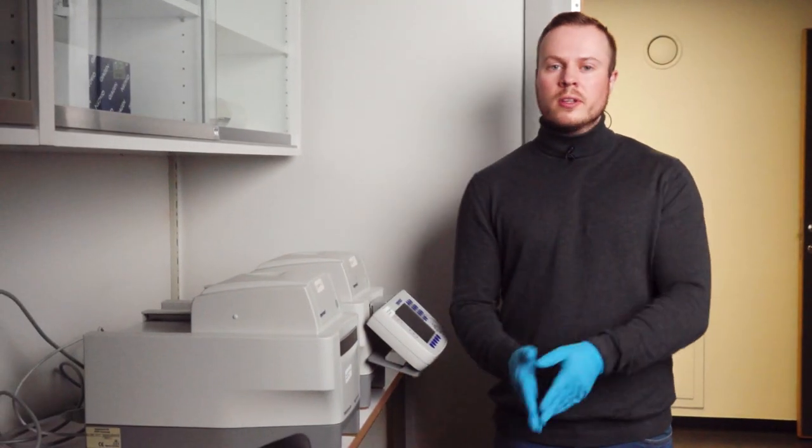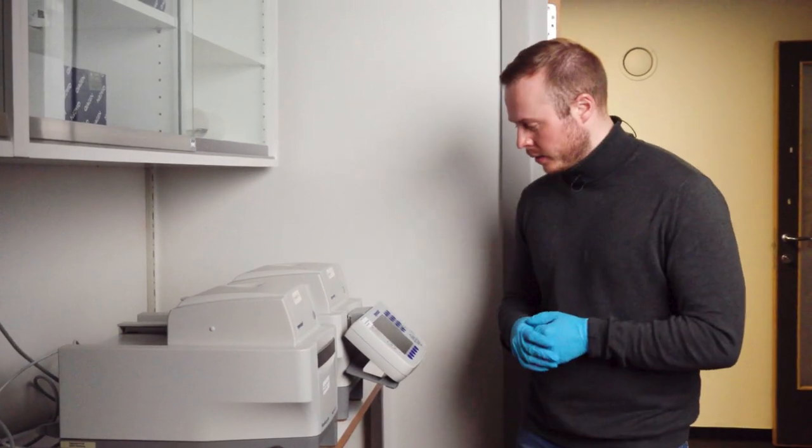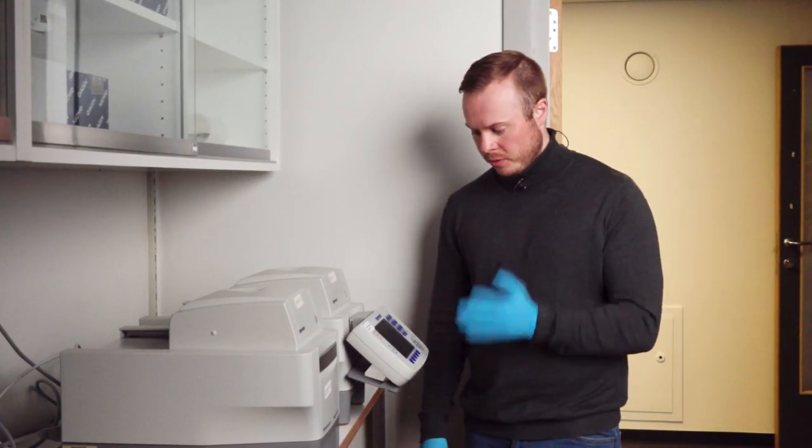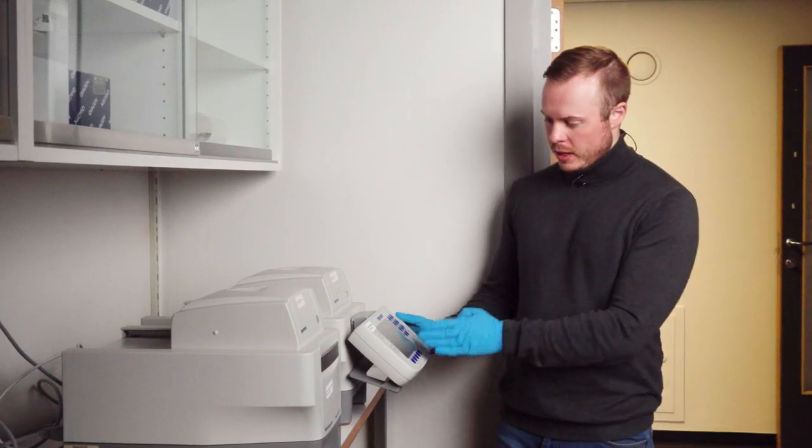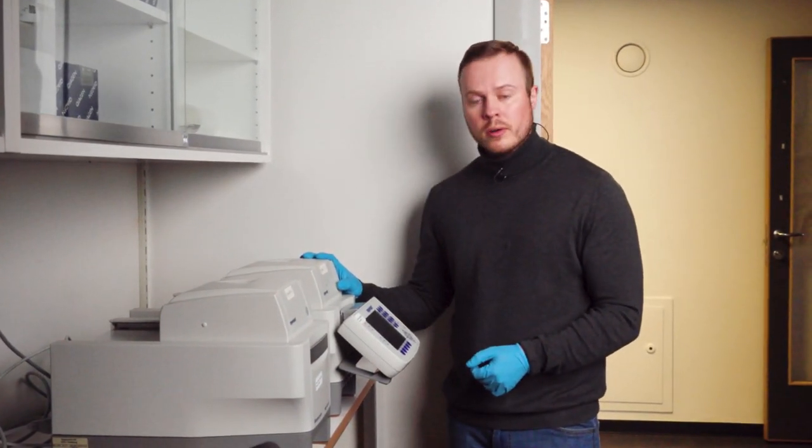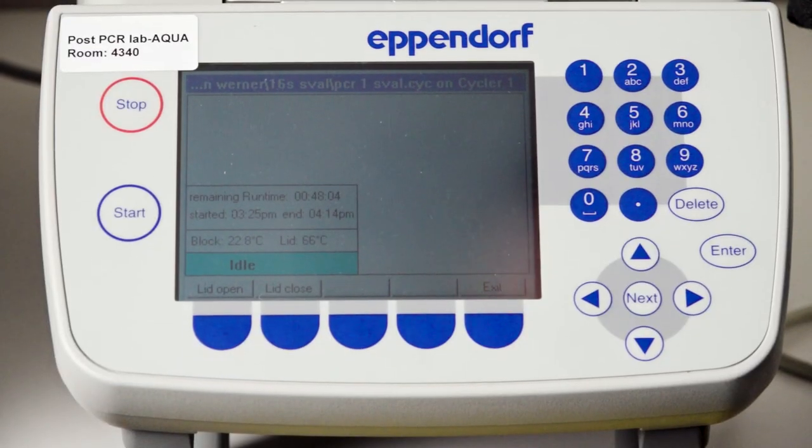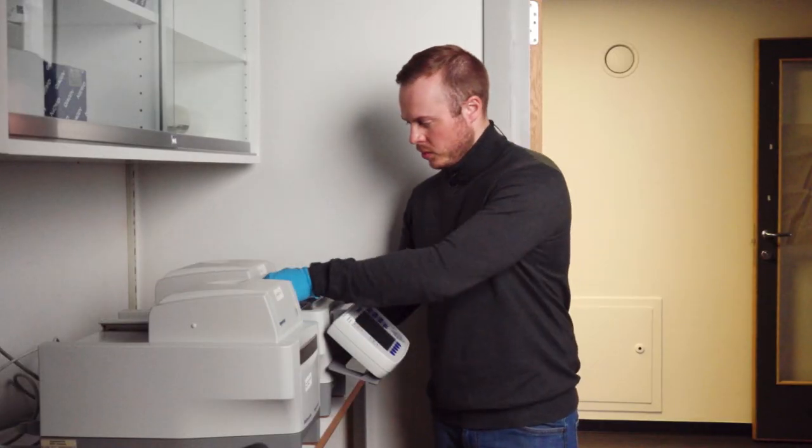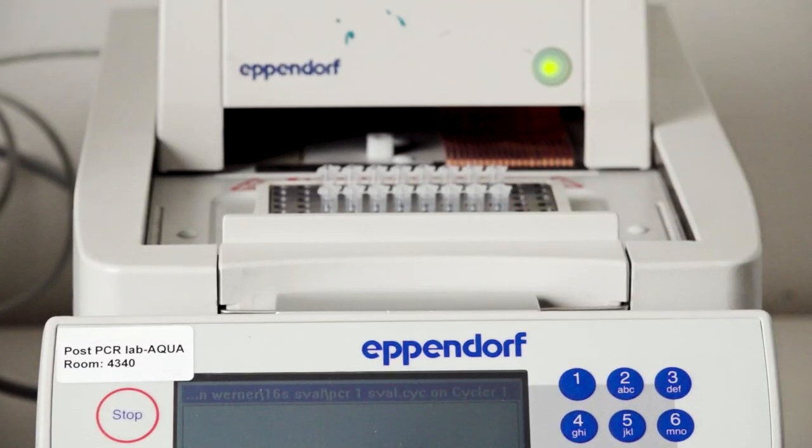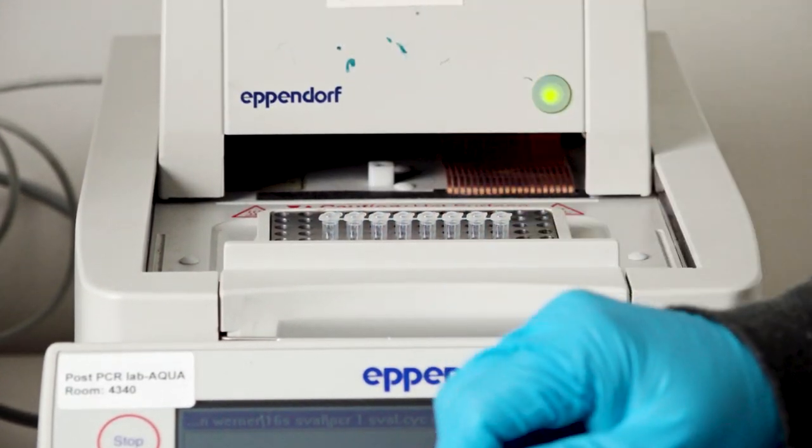Now I have finished the gel and I took a little break as well. The machine has been running for 50 minutes. Now it says idle here and the light is not blinking anymore. So then you push the lid open button and you move the lid backwards.